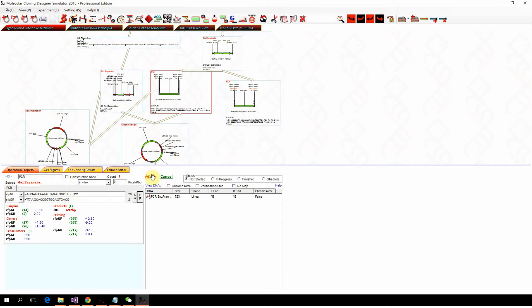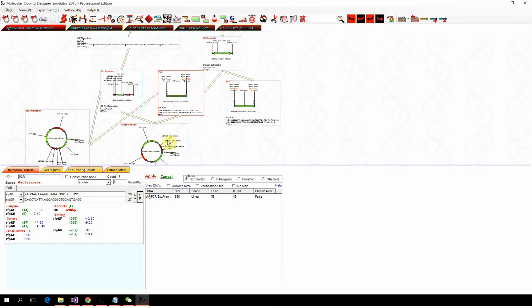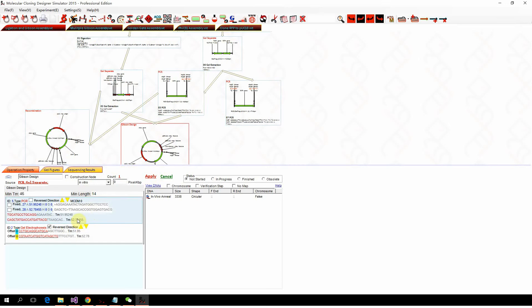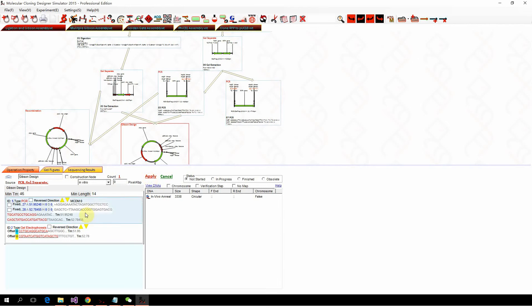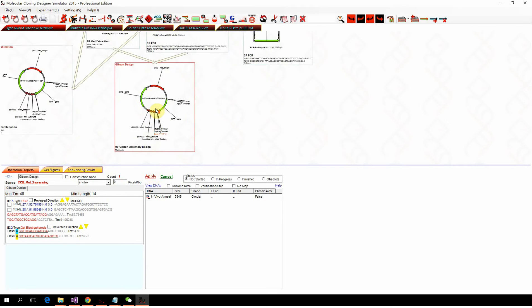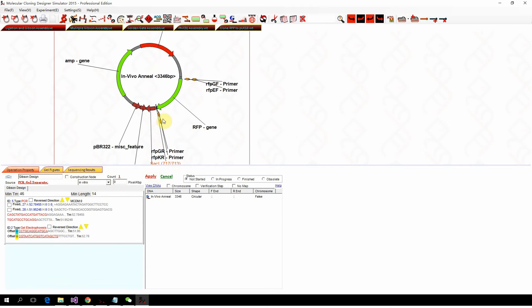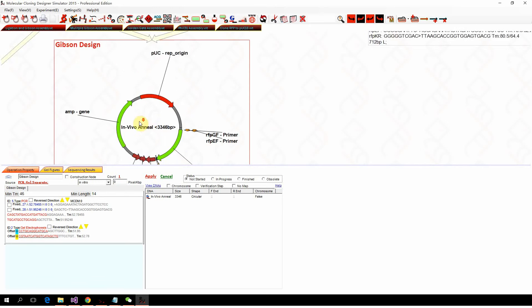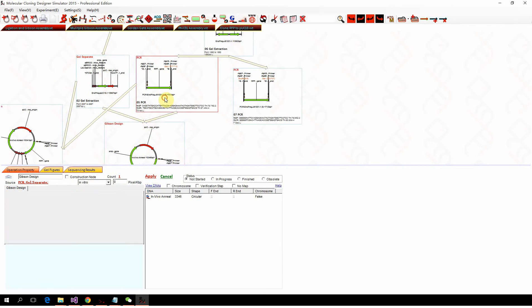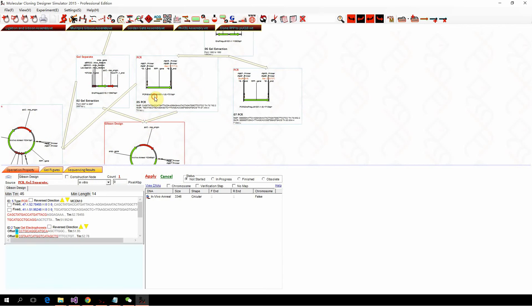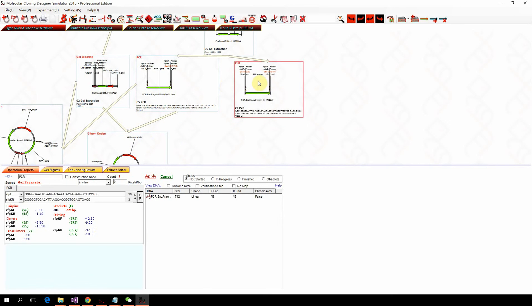For example, if we want to insert a Sec1 site for later use, we can clone in the same direction, apply, and you can see the Sec1 site here just right after the RFP. That's how you can use Gibson design to design the primers and the Gibson assembly.